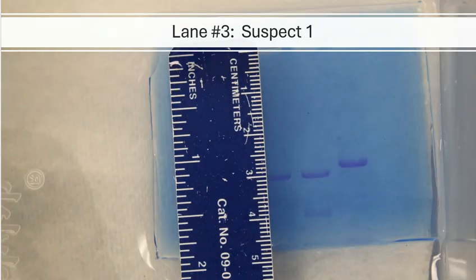Next up is lane number 3, and with lane number 3, I see suspect number 1. If I look at this gel, I definitely see 1 band, right? There is 1 band that is here, absolutely. And that's really all that I saw in person as well.